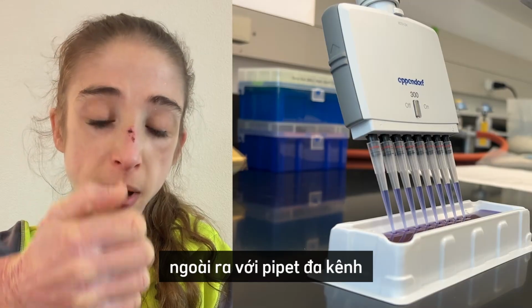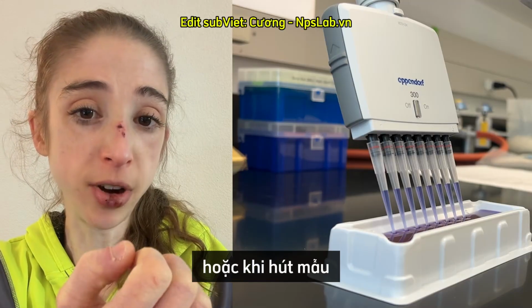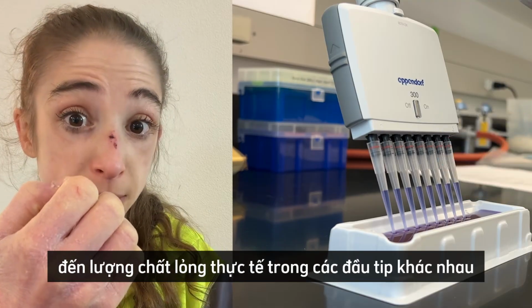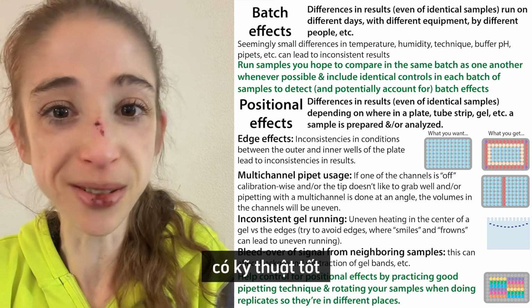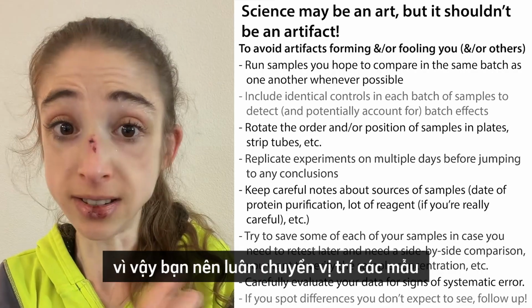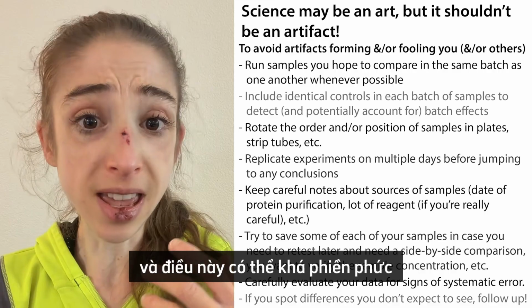Also with multi-channel pipettes, if you are at an angle when you're picking up the tips or when you're aspirating, that could influence the actual amount of liquid in the different tips. And so rotating your samples is the best way to account for this, and then also having good technique when you're pipetting in the first place. So you want to be rotating your samples, and this can be a bit of a hassle.